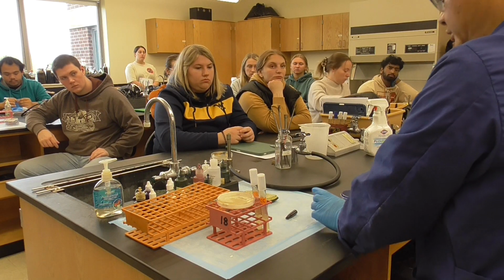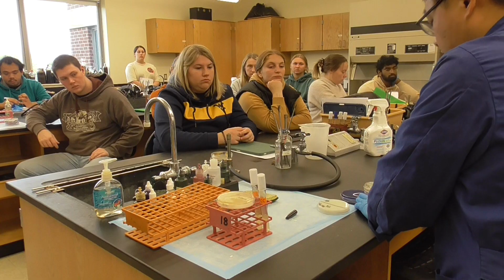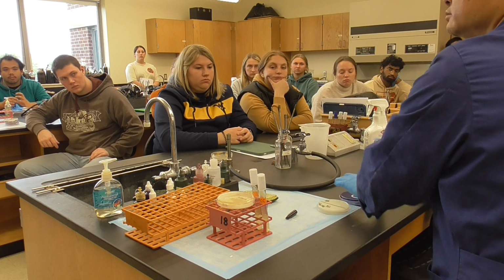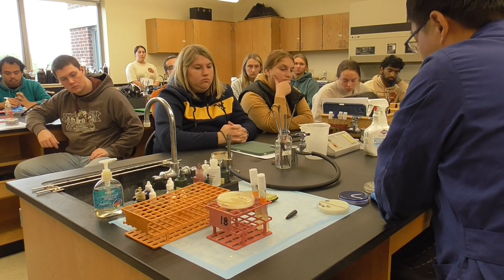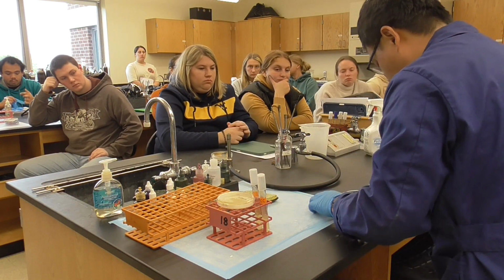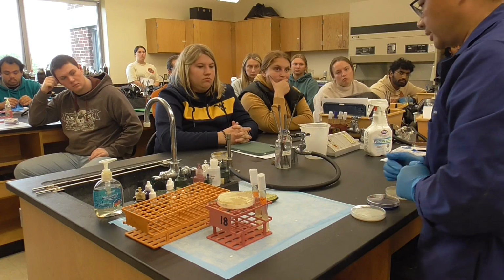What bacteria are you going to put there? E. coli and Bacillus subtilis. For this one, what? E. coli and Staphylococcus aureus, so SA. The last one, E. coli and Bacillus subtilis. Okay, that's a label, very simple. Now, make sure it is in the same corner so you can see it. This side is E. coli, this side is the other bacteria.